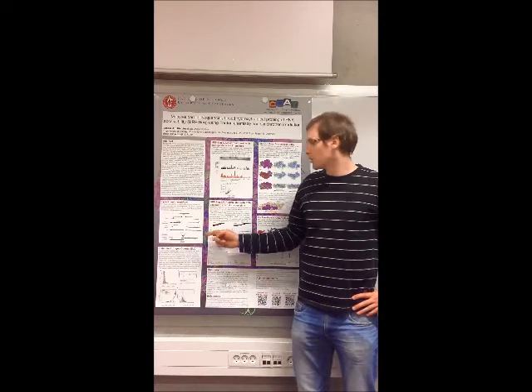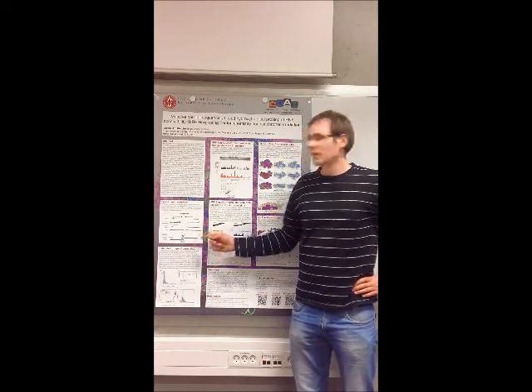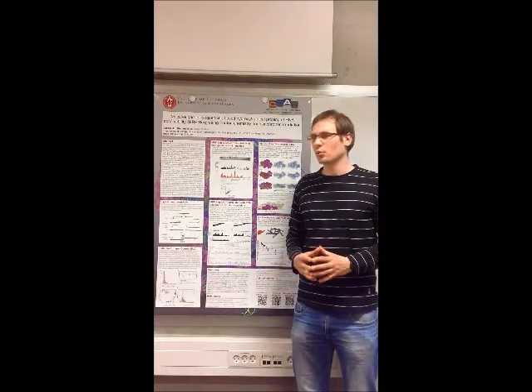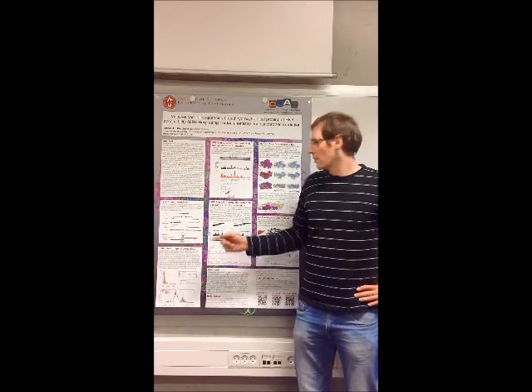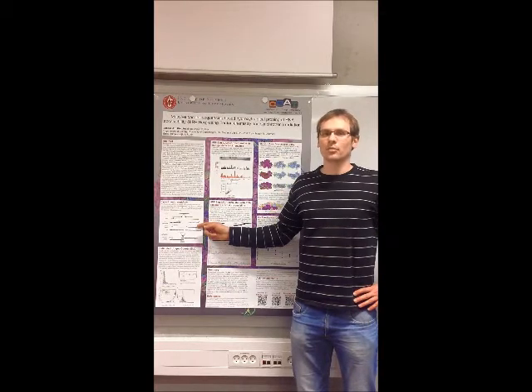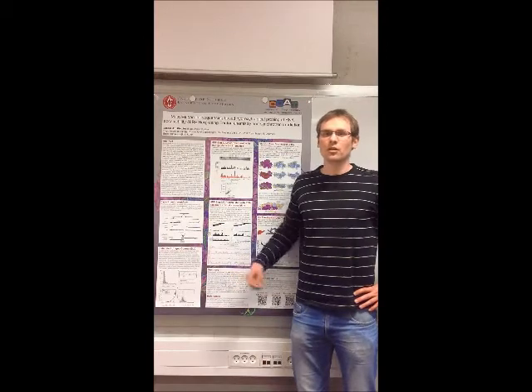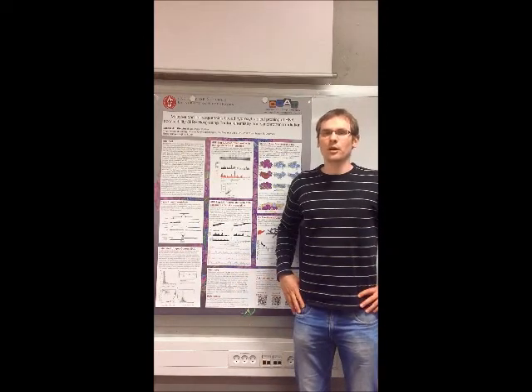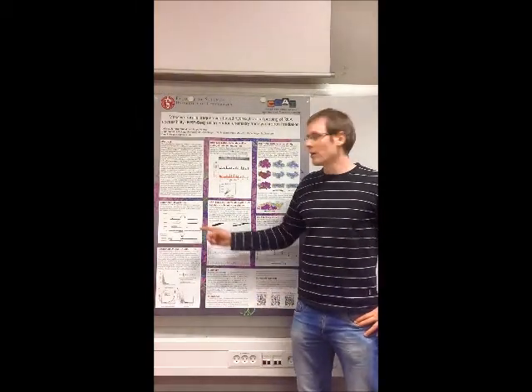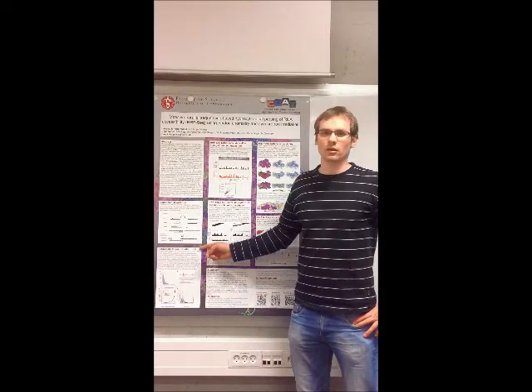During the experiment, in the PCR step, the primer introduces the sample-specific barcodes, allowing samples to be pooled. Additionally, in the adapter ligation step, a 7-nucleotide random barcode is introduced, which is useful for distinguishing PCR duplicates from real biological copies. Information from random barcode sequencing is used for estimated unique counts calculation.